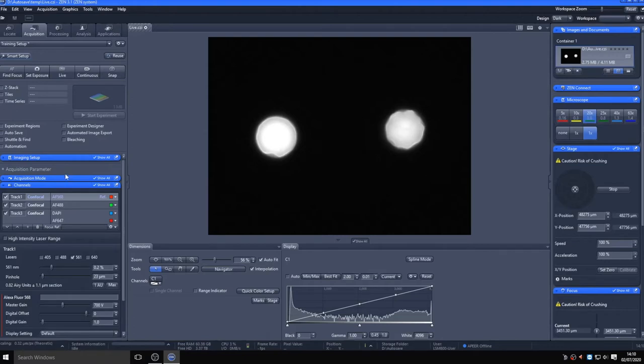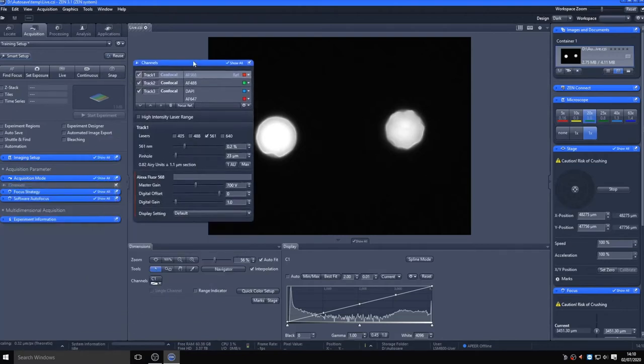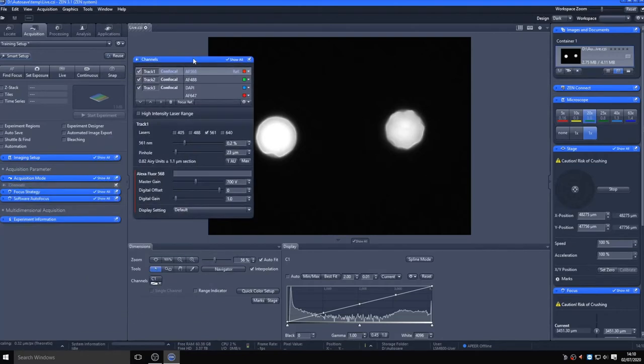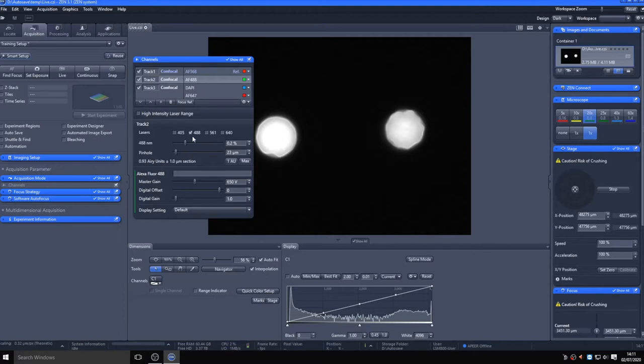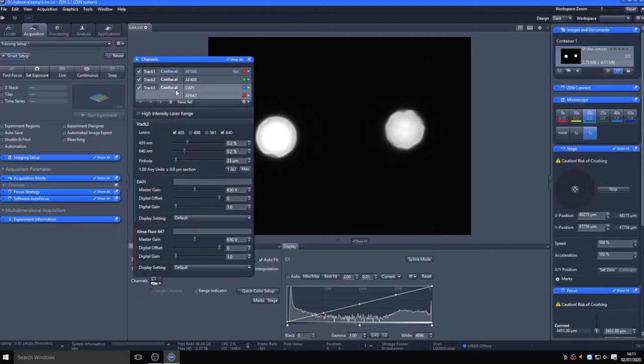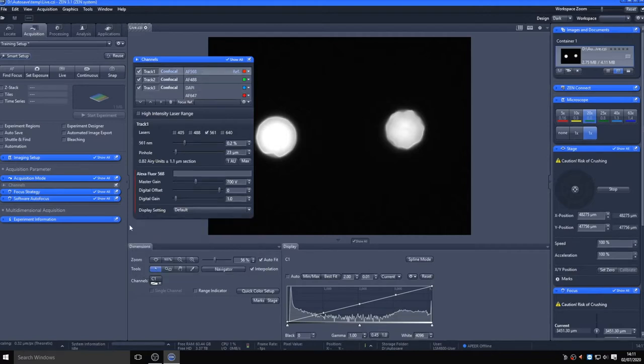You can pop out the toolbars and rearrange as you prefer. Here I have popped the channels tab out so we can see that and the rest of the acquisition parameters at the same time. You can see the system has been set up in three separate tracks with default laser powers and gain settings: 568 and 488 singly, using the 561 and 488 lasers respectively, and a third track with DAPI and 647 fluorophores, where both 405 and 640 nanometer lasers are on at the same time.